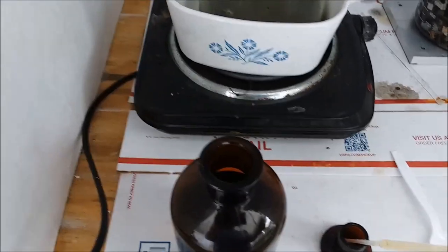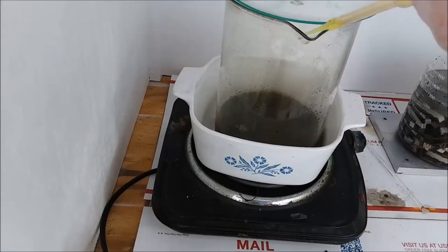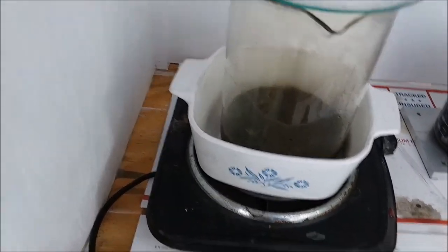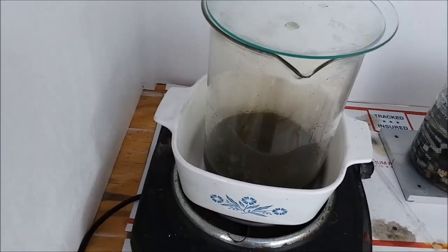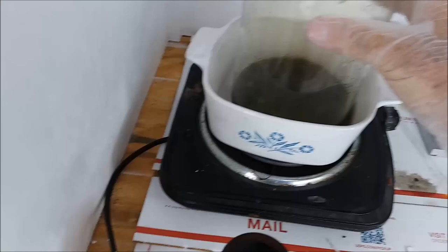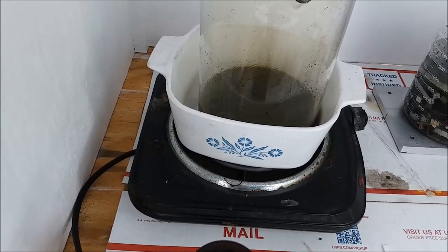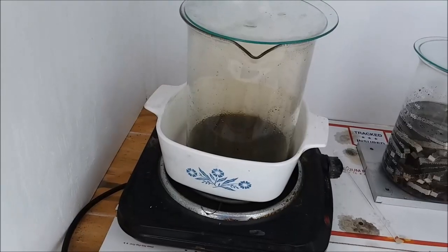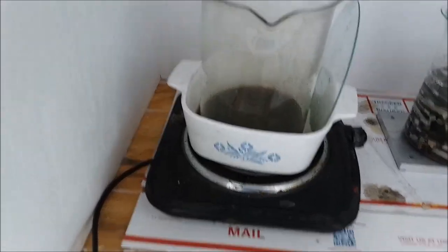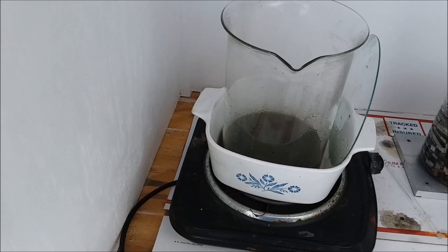I'm going to add one more shot of nitric acid just to make sure everything has gone into solution. There's hardly any reaction — almost nothing. I'm thinking everything that's going to go into solution has gone. I'll let that cook for a bit, stir it up a little. I'm calling this reaction done. I'm going to denox it with sulfamic acid. This may be very foamy because I may have an excess of nitric in there, so I'm going to put in just a little bit at a time.